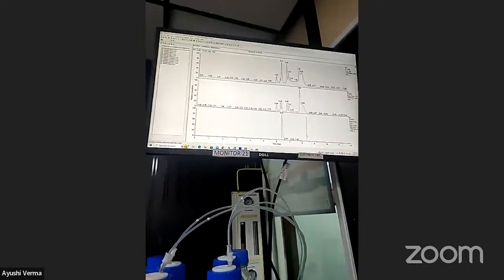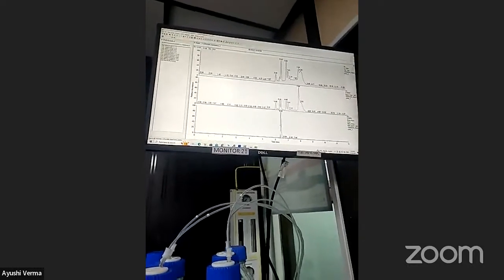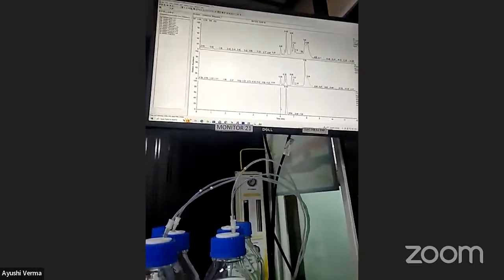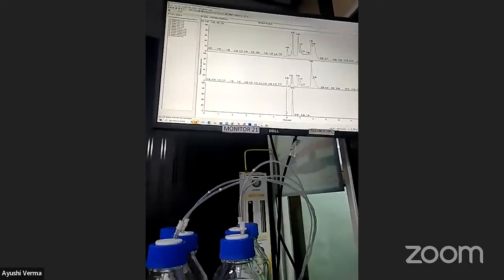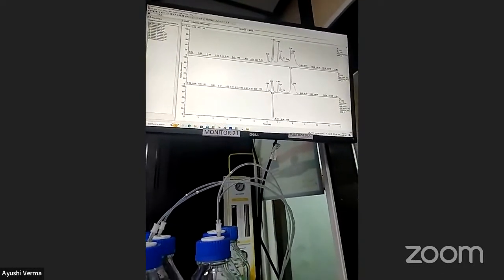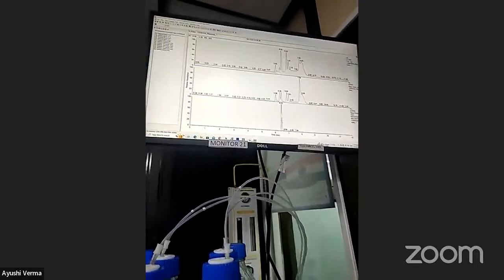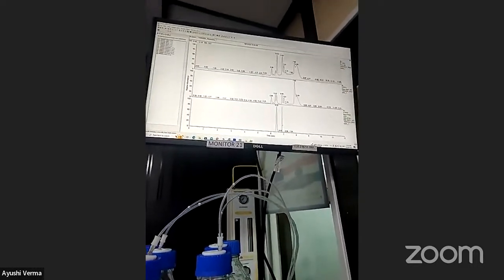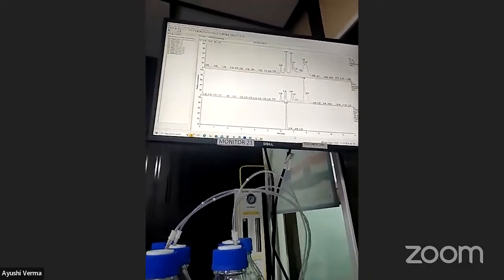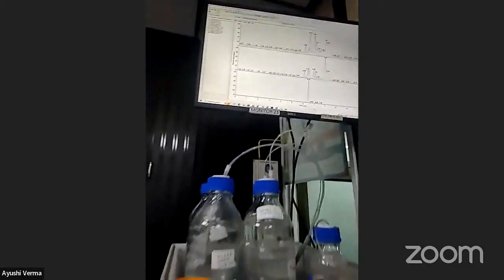Now, in the case of metabolomics, we also need to add some kind of internal standards and run QC pools to check that there is no technical variability between our runs. For example, this is one of the standards which should elute at a specific time throughout your experiment, with a certain intensity and a good, fixed shape. So, this is in brief about the metabolomics experiment, global metabolomics. Yeah, thank you.